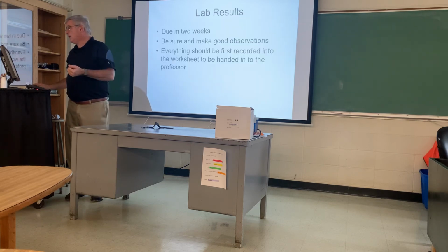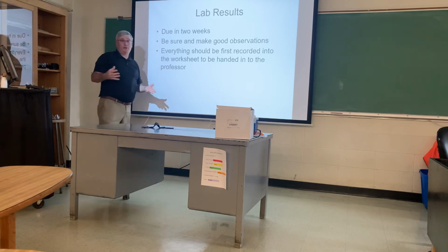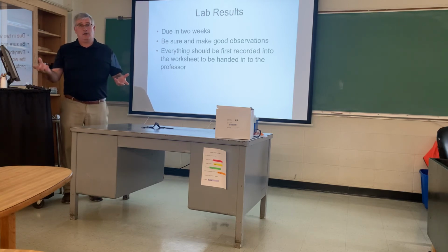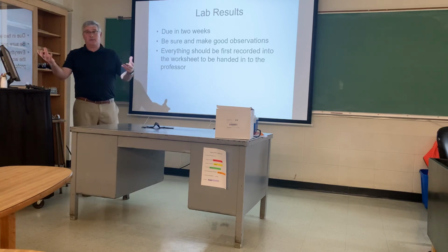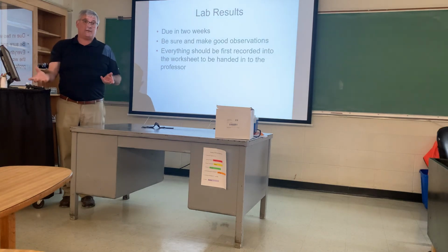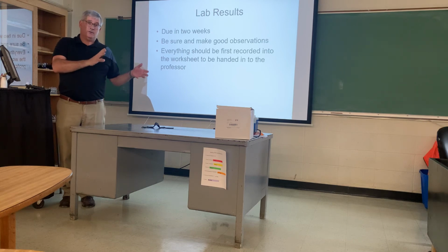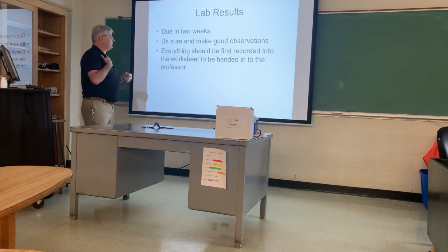The results for this, you actually have 2 weeks. What you want to do this week is make sure that you get all of the known reactions done. You can even take photographs with your phone if you would like to document that so you can go back over. And remember that in 2 weeks when you're working to find the unknowns, you can actually go back and make the compound that you think you have and see if it behaves in the same fashion. So your chemistry doesn't stop because you've made the key. You actually can go back and redo a key section to make sure that that's the compound that you have as an unknown. So you do confirmation chemistry.